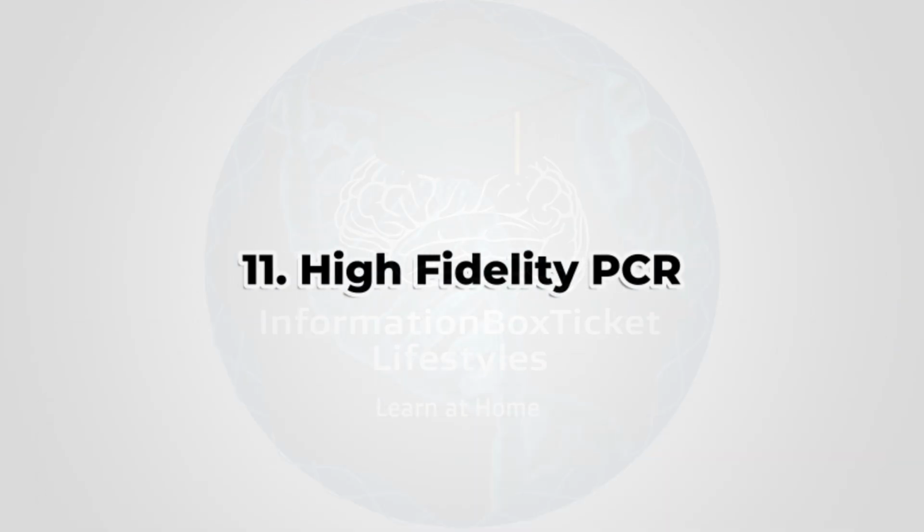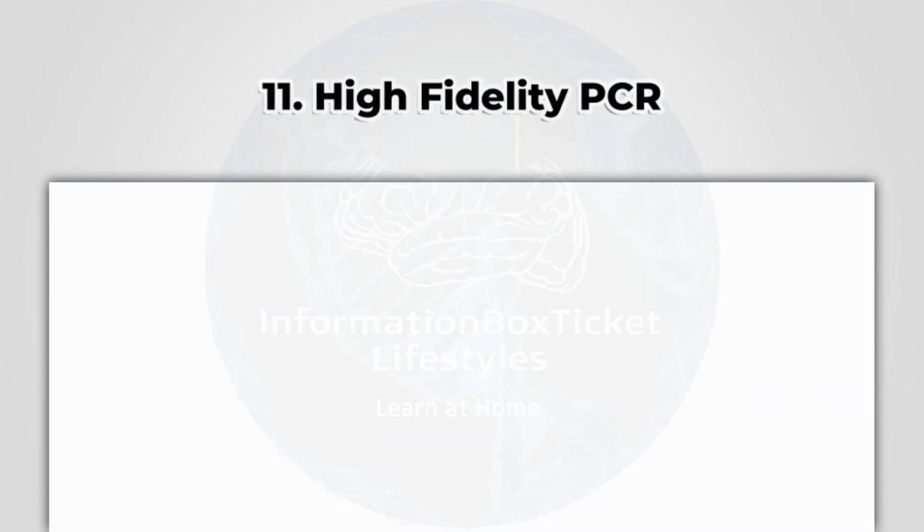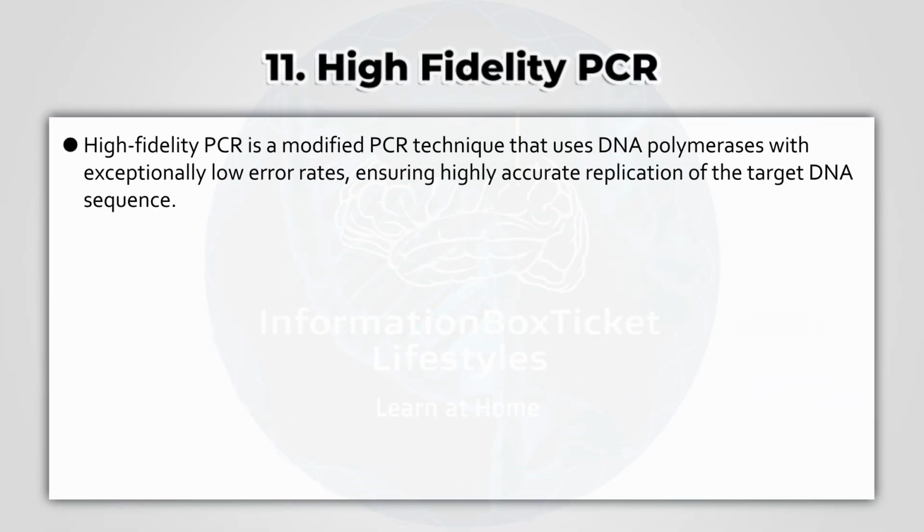11. High-fidelity PCR. High-fidelity PCR is a modified PCR technique that uses DNA polymerases with exceptionally low error rates, ensuring highly accurate replication of the target DNA sequence.